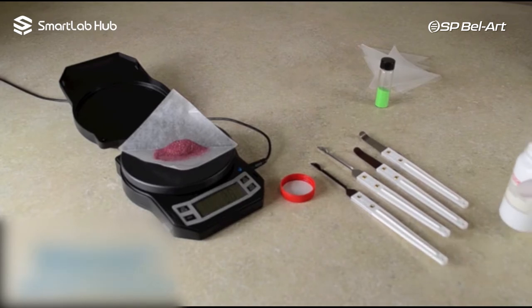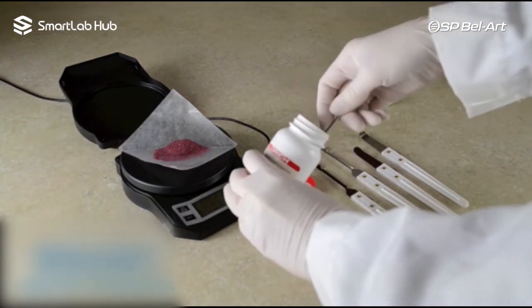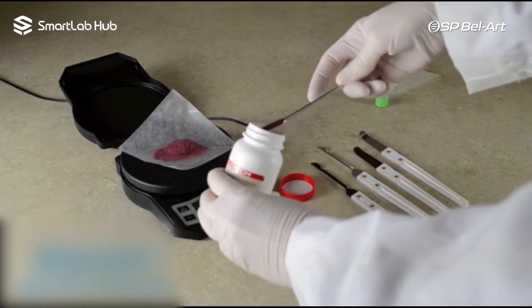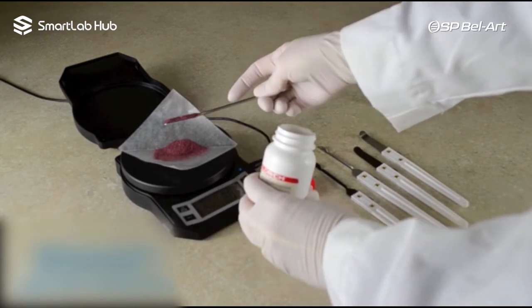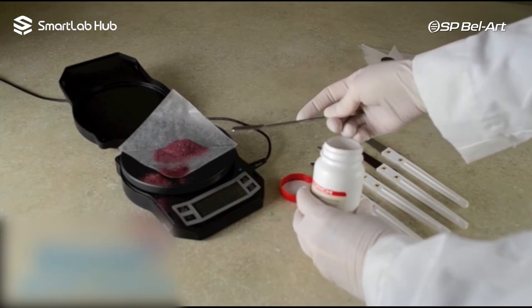A Quaver can mean a musical note played for one-eighth the duration of a whole note, or it can mean a trembling shake. When weighing small quantities, a trembling shake of the hand can contribute excessive amounts of material to the measured batch.